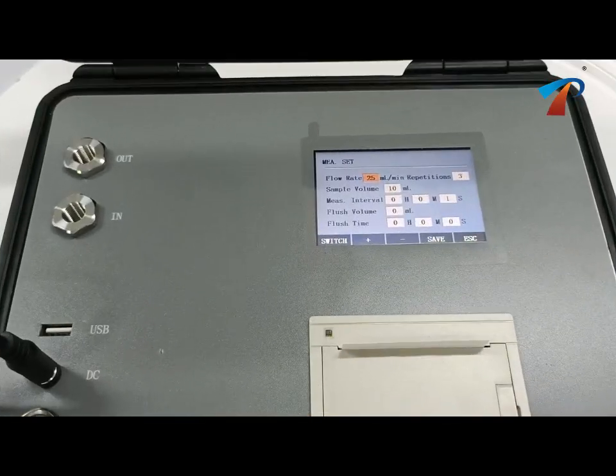Click on Measurement settings. The first is the flow rate, which can be set according to your own requirements, and the recommended flow rate is 25 milliliters per minute. The number of repetitions is 3 or 5 times, and the sample volume is 10 milliliters. The flushing time and the flushing volume are the same.